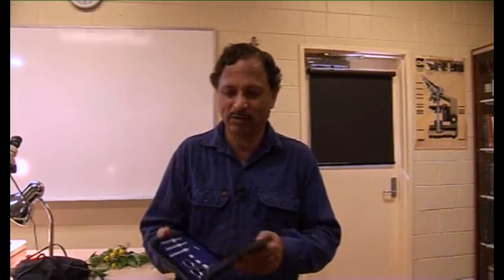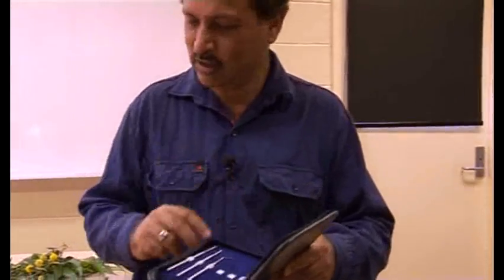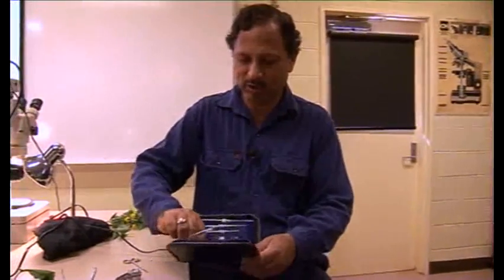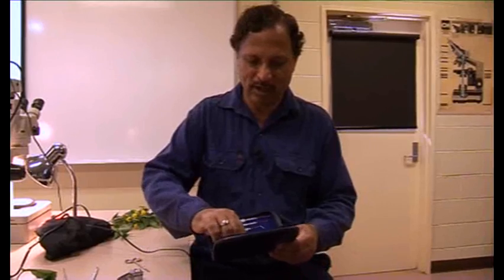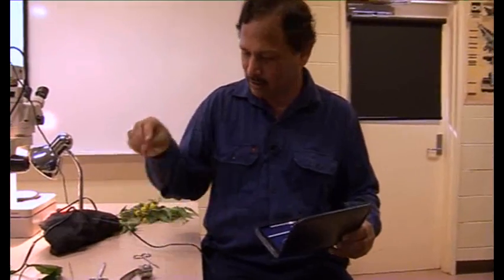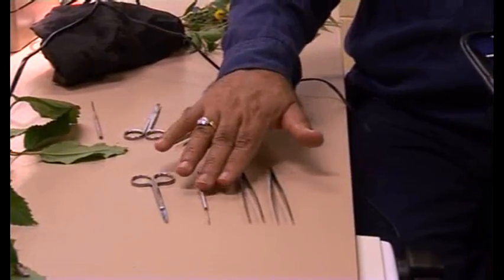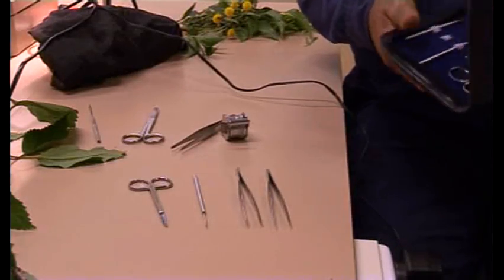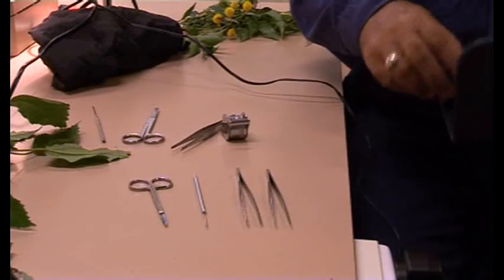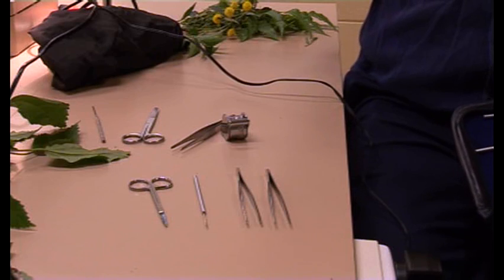At minimum, you would have this dissection kit. Most students will have this dissection kit. Within that, what we need is a pair of scissors, a pair of sharp tweezers, a pair of blunt tweezers, and a sharp needle — minimum two pairs of tweezers, one needle, one pair of scissors required to dissect the flowers. And also a scalpel with a scalpel blade would be necessary to do the cross-section to find out how many ovules are there in the flower.